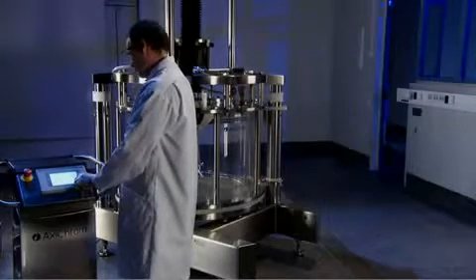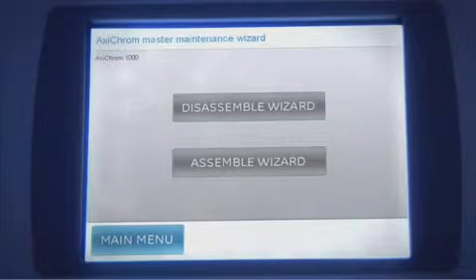To disassemble the column, the operator selects the maintenance and disassemble guide on the touchscreen.